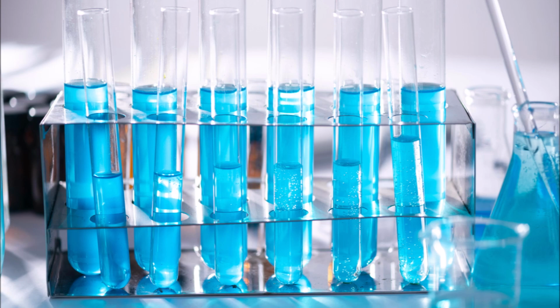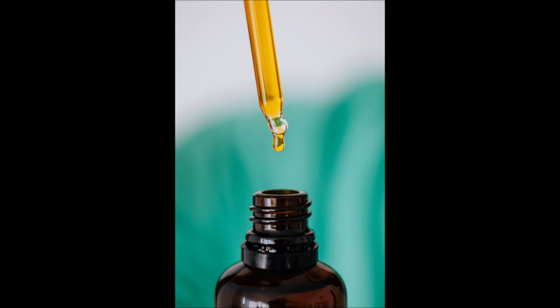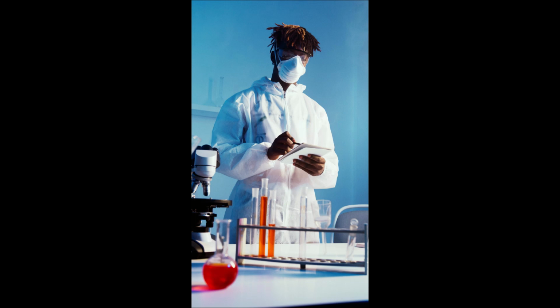Number one is selecting the right plant species. The first step in collecting endophytes is choosing the appropriate plant material. Consider the following when choosing the plant material. Number one is healthy plant tissues. Collect samples from symptom-free plants to avoid contamination with pathogens.